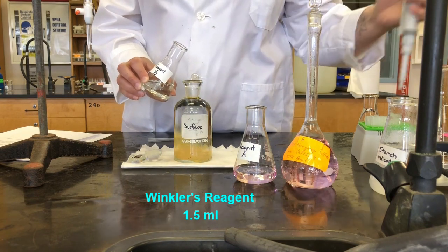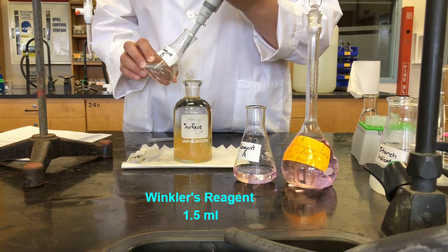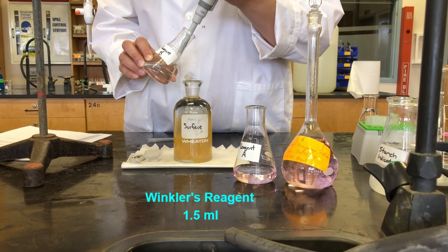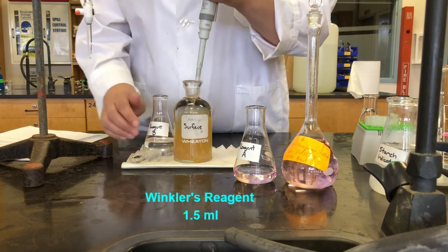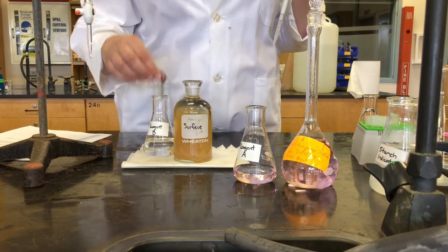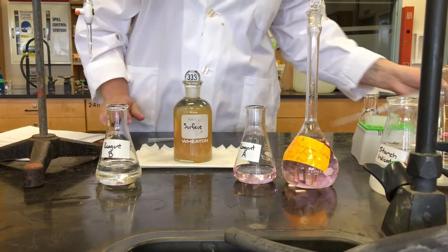I'll replace that tip. And 0.5. And you can see that that certainly changed the color. Whoops, wrong bottle. Certainly changed the color of our solution.